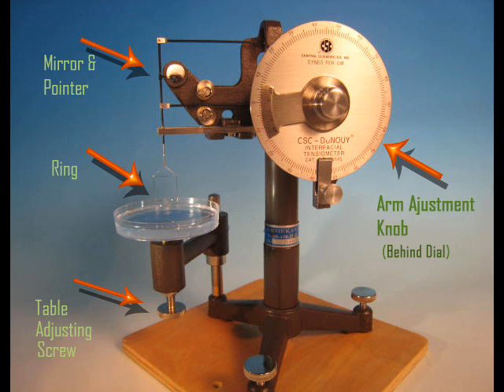To perform the test there are a few key parts of the instrument. The mirror and the pointer indicate the effect of surface tension forces on the ring as it passes through the sample surface.